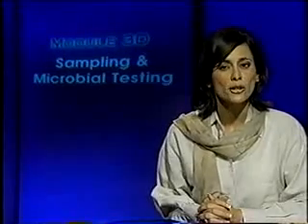The main reason for microbiological testing is that currently approved antimicrobial treatments cannot guarantee total elimination of all pathogens from seed. Even if only a few pathogens survive a seed disinfection treatment, they can grow to high levels during sprouting. Spent irrigation water from each production lot should be tested microbiologically to ensure that contaminated product is not distributed.